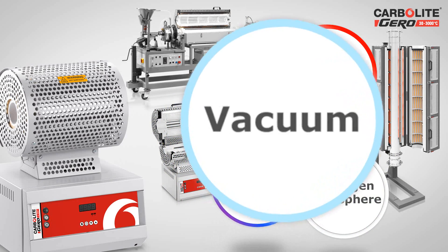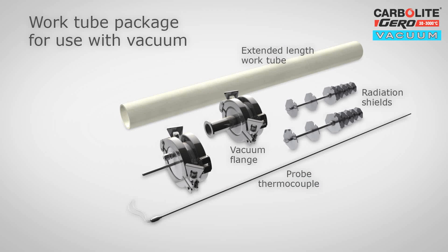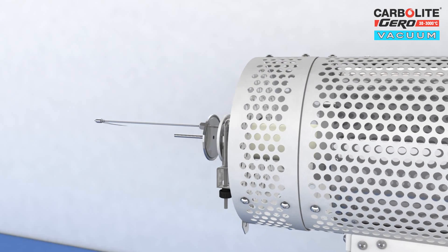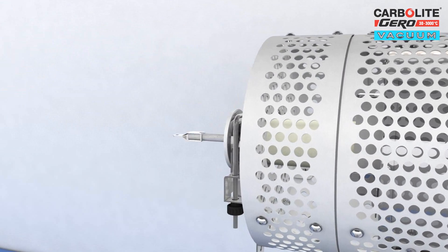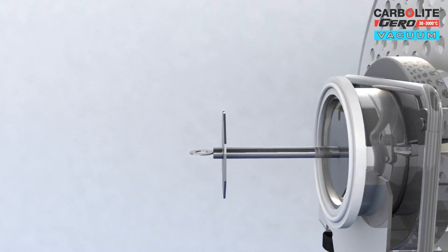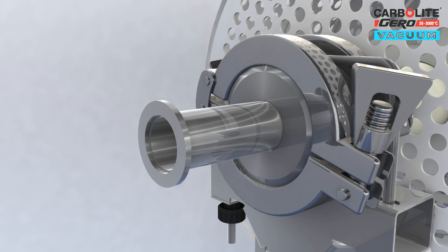For tube furnaces working with vacuum pressure, Carbolite Gero offers a work tube package including radiation shields and end seals with an NW or KF vacuum flange, to which a vacuum pump can be attached. In this case, radiation shields are used to maintain temperature uniformity and reduce heat losses instead of insulation end plugs, which would contain trapped air in the porous insulation materials.